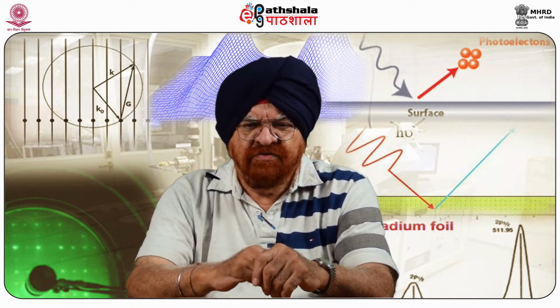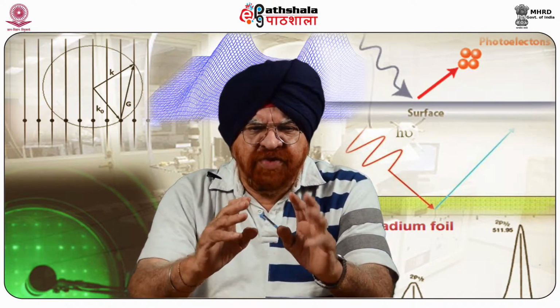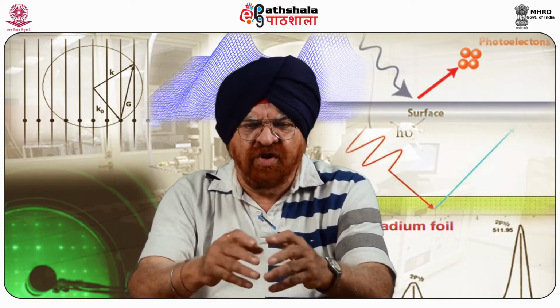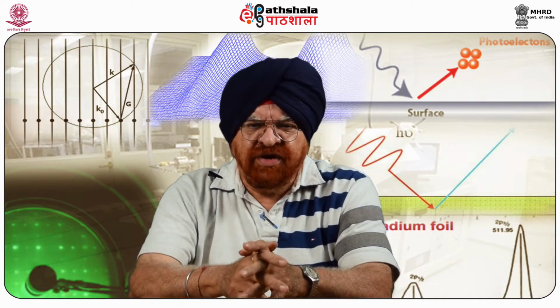ESCA is a surface analysis technique based on the photoelectric effect that uses an X-ray beam to eject electrons from a surface. And that's the principle used in all analysis here. ESCA is based on the photoelectric effect.